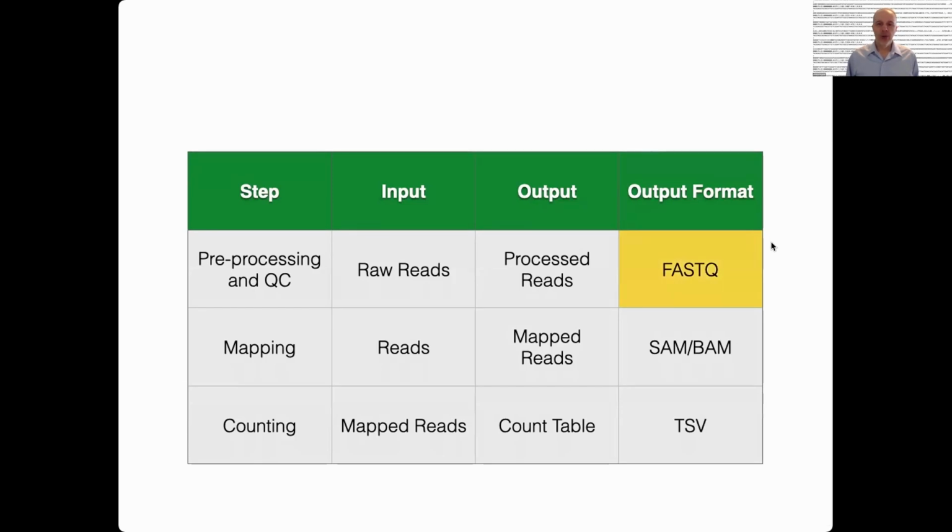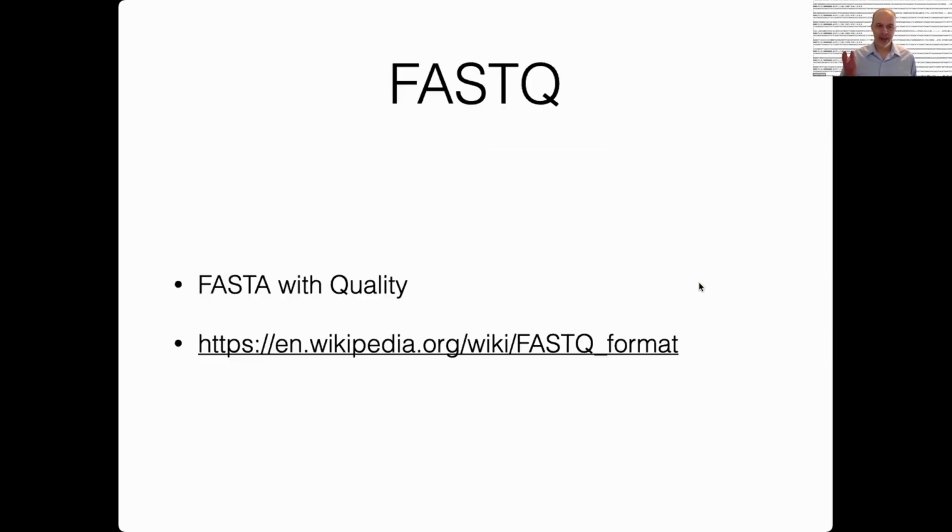So let's start really quick looking at the FASTQ file format. You already saw an example of this. I just want to tell you a little bit more about what we're going to be seeing there, because each of these file formats is kind of complicated. It helps to understand a little bit what it is. So the name FASTQ comes from another format called a FASTA.